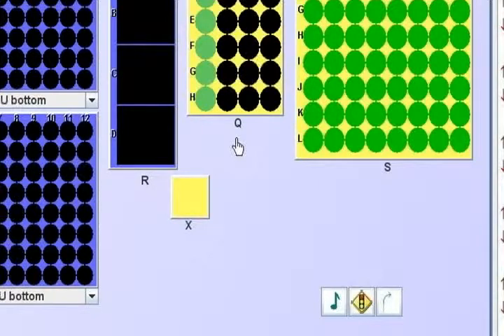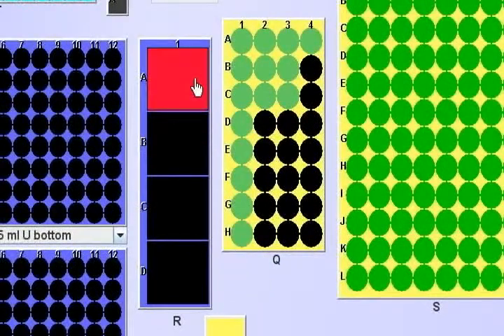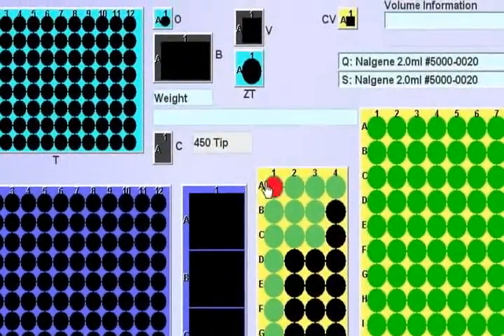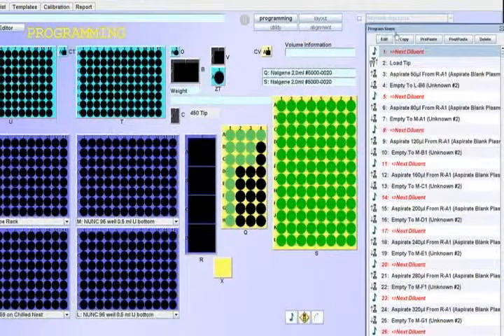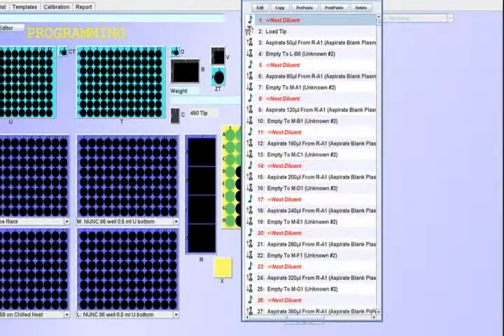When running by position, you are obligated to put each vial in its specific position. When running by barcode, you simply have to have the path highlighted to show which one is next in line, starting from QA1. On this sample program, there was no identifying barcode for standard, QC, or blank. Thus, they must be processed by position. There were barcodes shown for the unknowns.